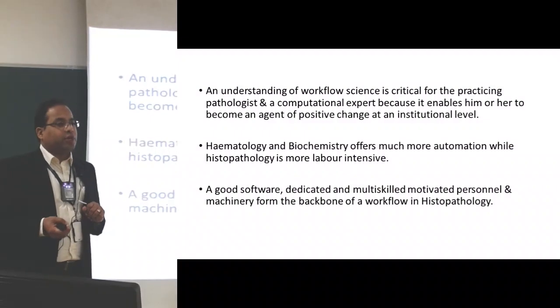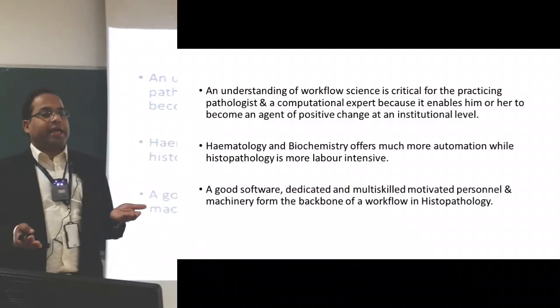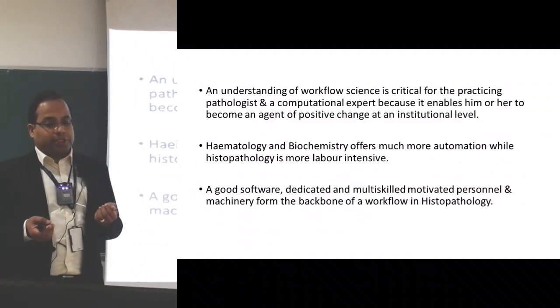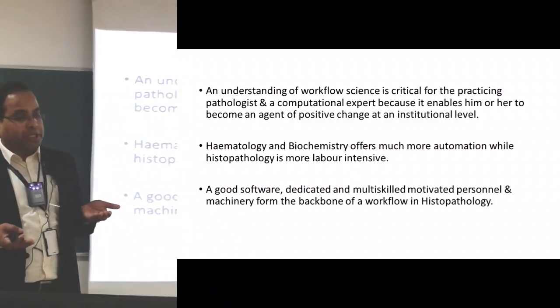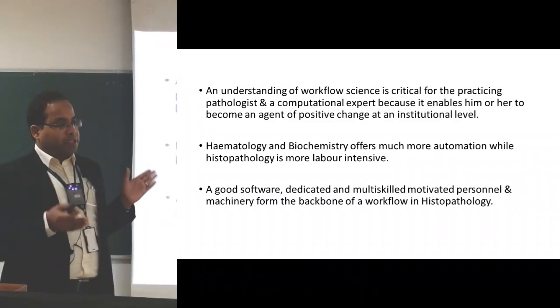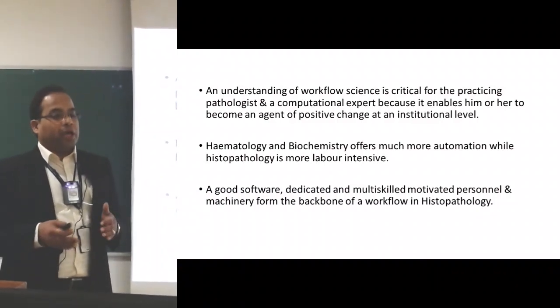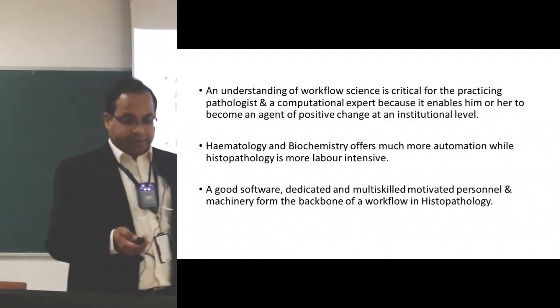An understanding of the workflow science is critical for the practicing pathologist and the computational expert because it enables him or her to become an agent of change, positive change at an institutional level. Hematology and biochemistry will offer much more automation than histopathology, which is much more labor intensive. As you will see, good software combined with dedicated and multi-skilled motivated personnel with machinery will form the backbone of a workflow in histopathology.